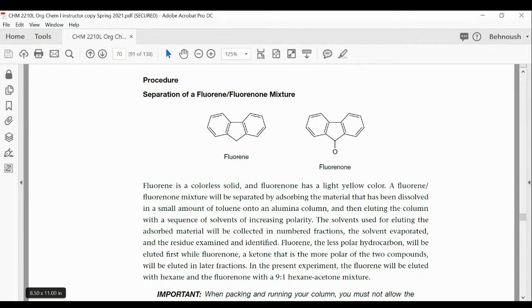The experience of being able to say whether fluorene starts coming out or stops coming out is better to watch than for me to talk about, because even when students were in class, until they actually did the experiment, they didn't understand the concept. Like, how are you using a watch glass to say fluorene is coming out or not? But when you watch carefully, it's very obvious, and it shows whether the residue is going to form or not. It helps you a lot in understanding which one is coming out first, or when it would stop coming out, when the entire sample would leave the column.